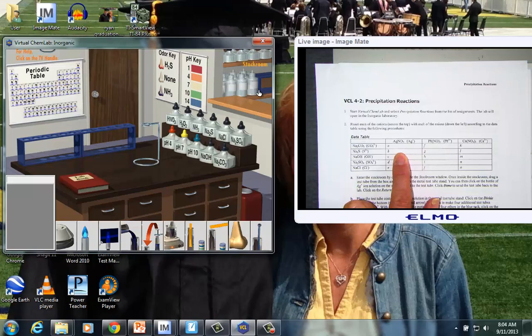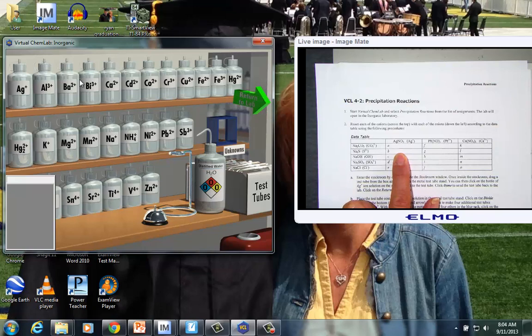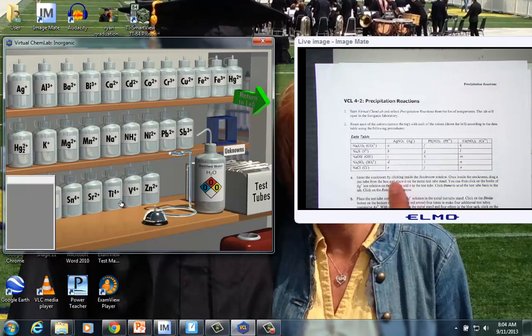First of all, we're going to need to go into the stock room. So I click into that area, and I see the list of positive ions all on the shelf. So we entered the stock room by clicking on the stock room window.